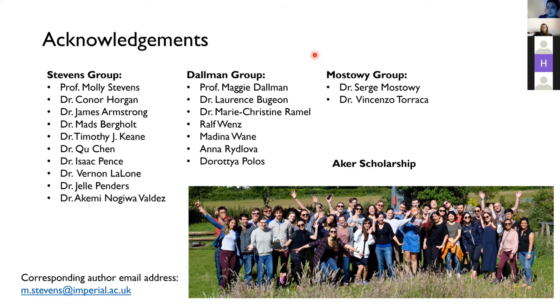That's why we've chosen tumor metabolism, bacterial metabolism, and liver metabolism, because you need a very well-defined question. In terms of time, typically these images take hours, so that's also worth considering. You get a lot of information, but it's quite time consuming to perform the experiments.